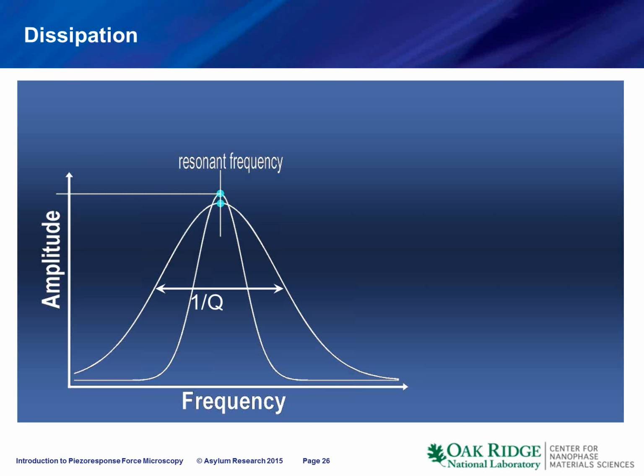So the DART method that Roger has illustrated is one way to perform piezoresponse measurements on topographically non-uniform surfaces. An alternative, or if you will, complementary approach to DART is the use of what we call the band excitation method. So let me illustrate what it is and how it is implemented and what it does, starting from the basic physics of the tip-surface junction.